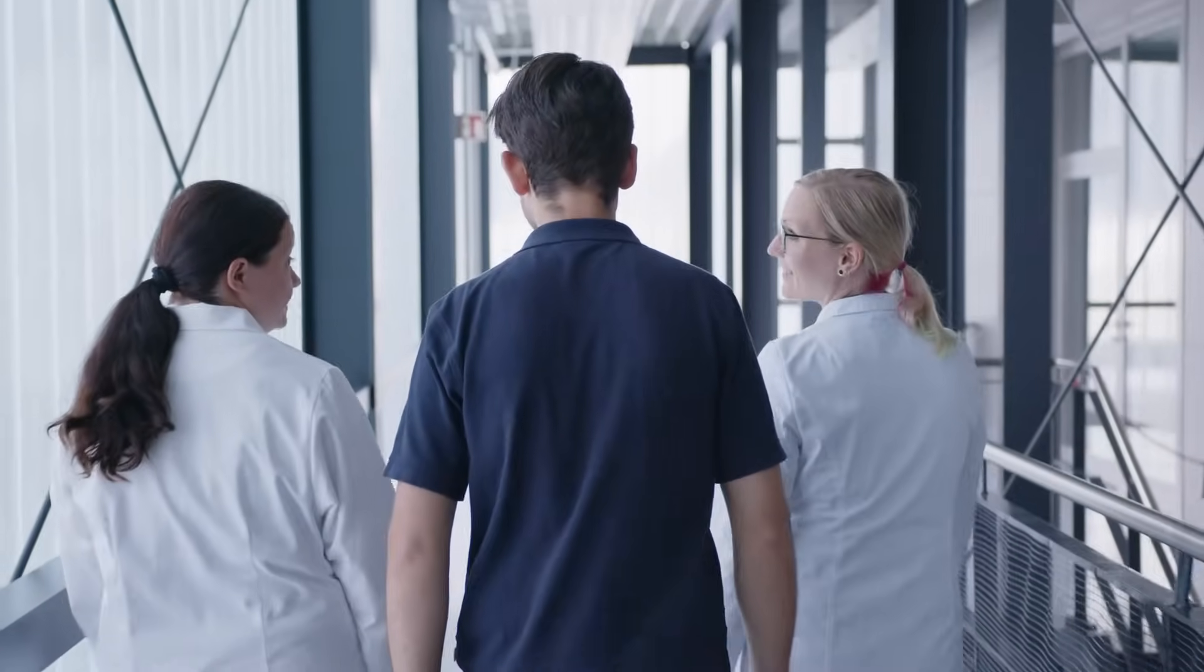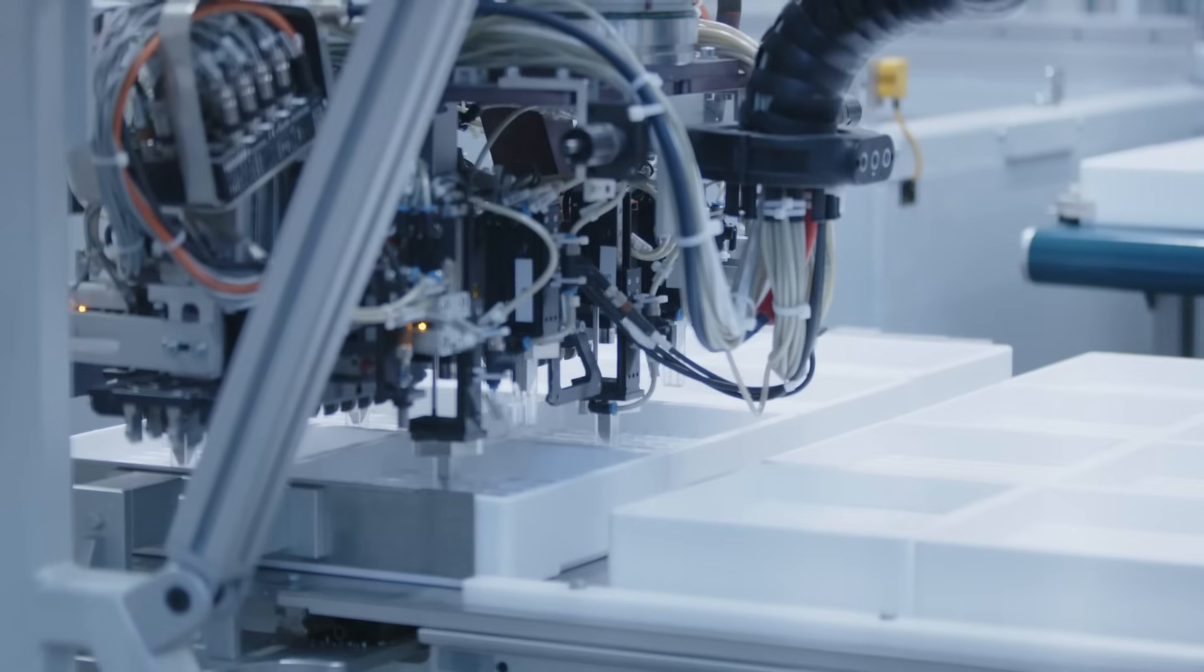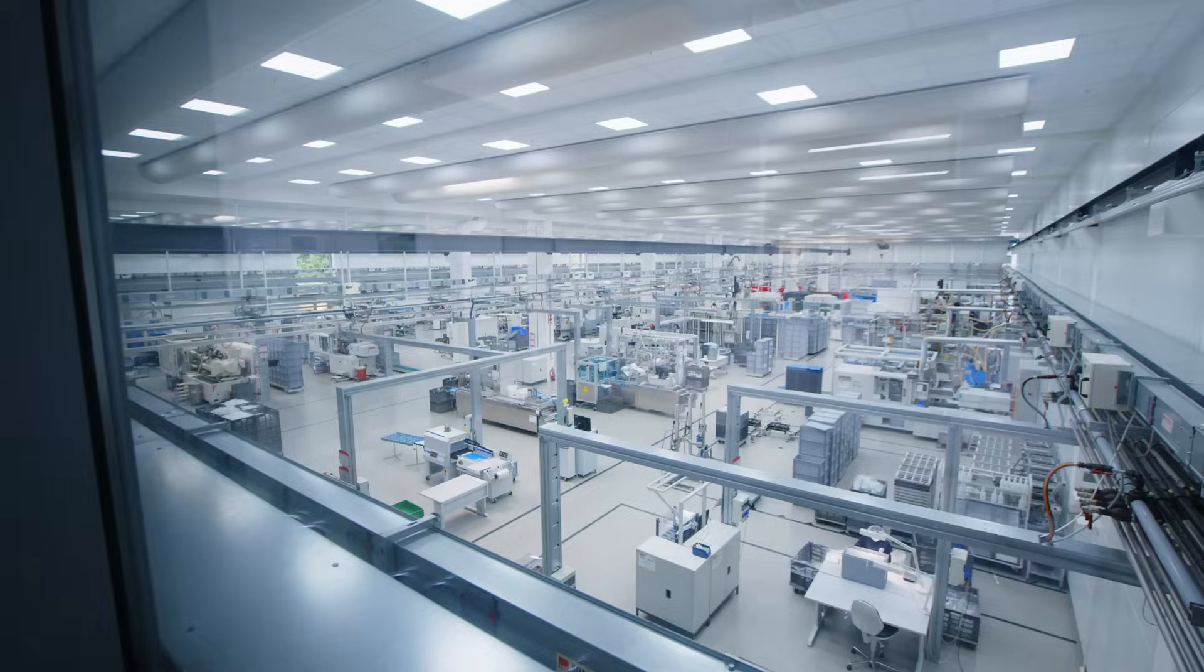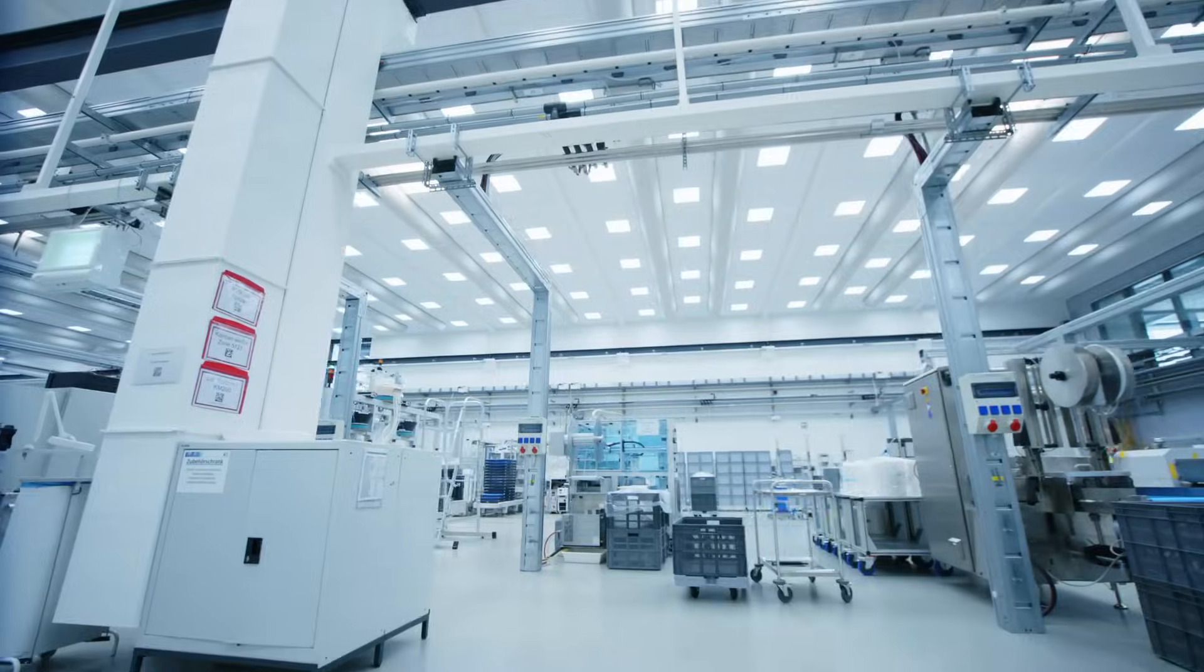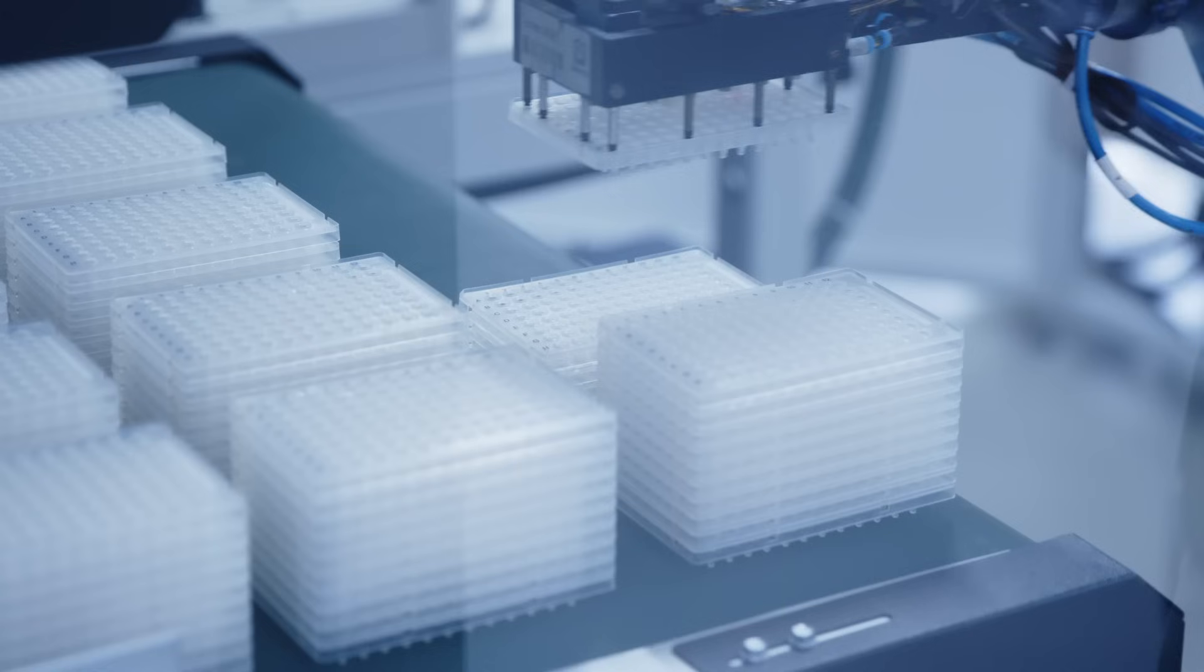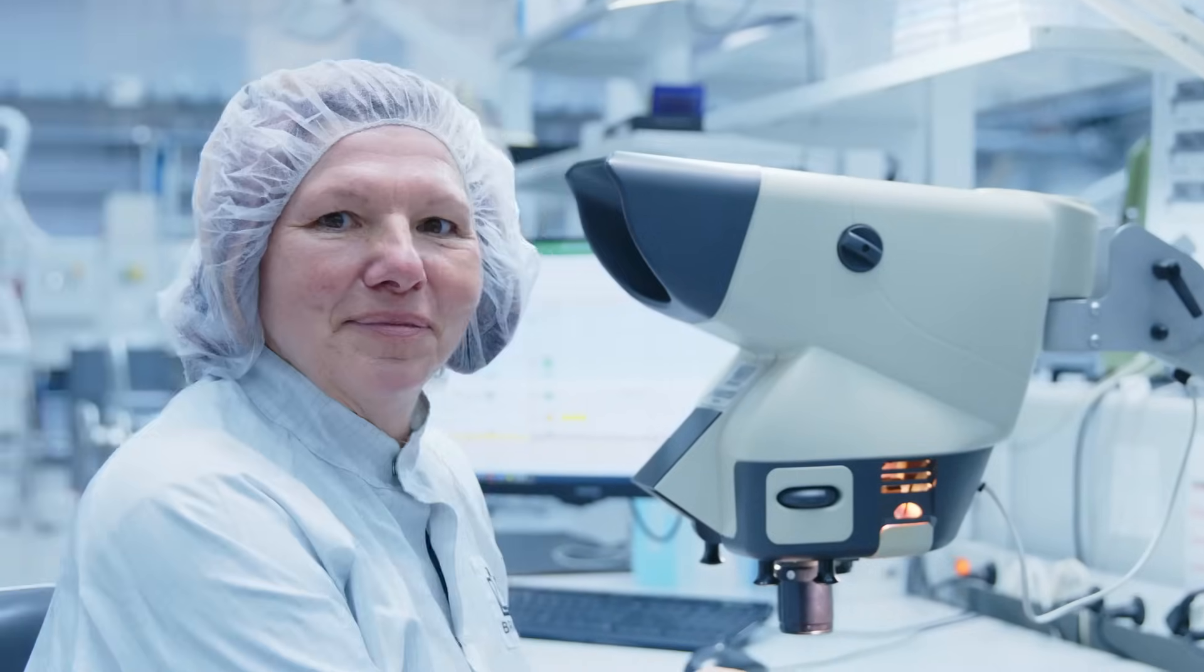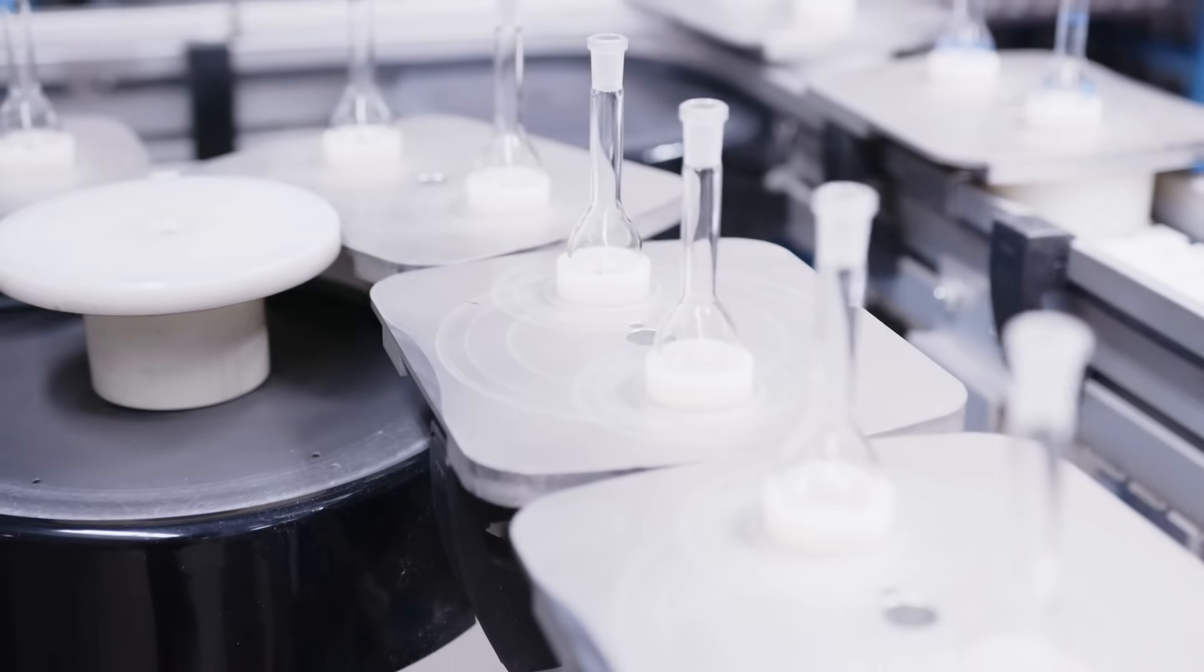Our quality simplifies your work because you can always rely on the results. Brand quality, made in Germany. This is one of the largest clean rooms of our industry. Here we manufacture life science consumables with certified quality levels.